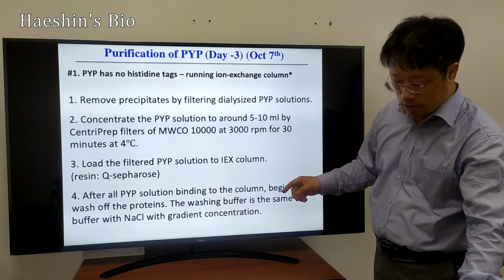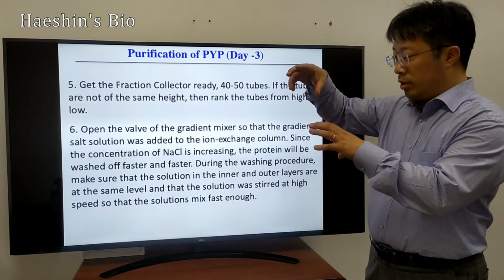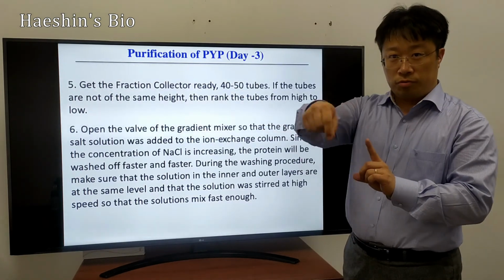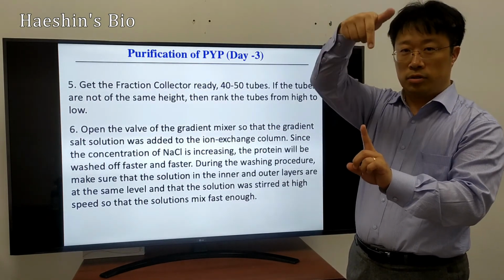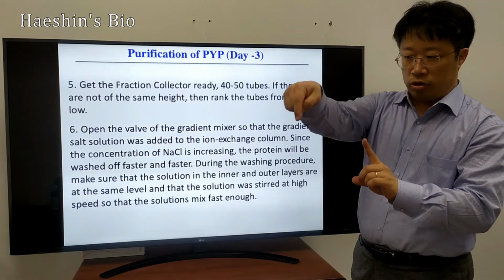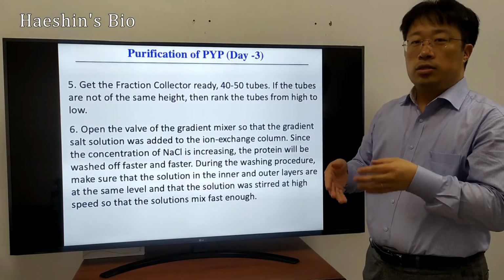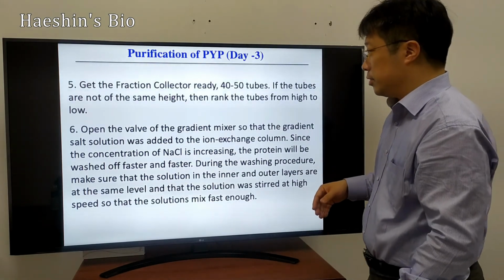So then after this you have the fraction collector, because the sodium chloride solutions will go down, and at the bottom you have collectors that are rotating. So you have this number of tubes, you put them there, and every time, maybe 5 minutes or 1 minute, they rotate, and the protein solutions will be eluted by the gradient of sodium chloride. We don't know which proteins are in which tube, but proteins are separated from the ion exchange column as the sodium chloride increases, and proteins are eluted sequentially: weakly bound protein is eluted first, and then strongly bound protein is eluted later. So that is the idea.